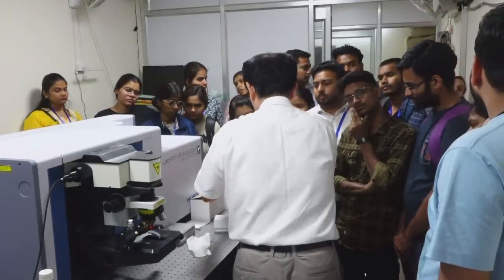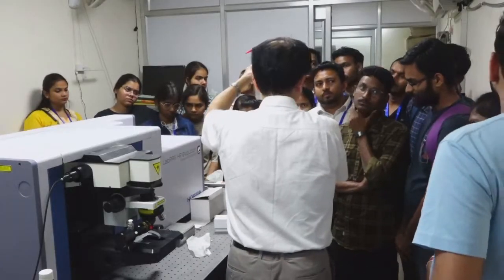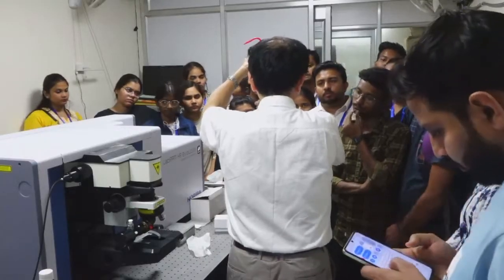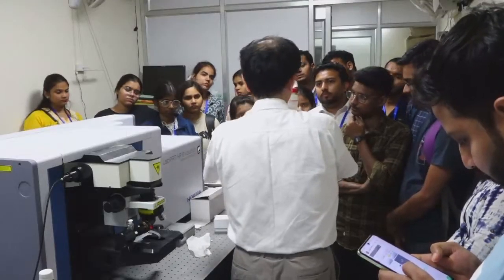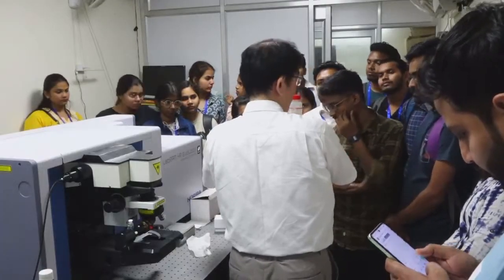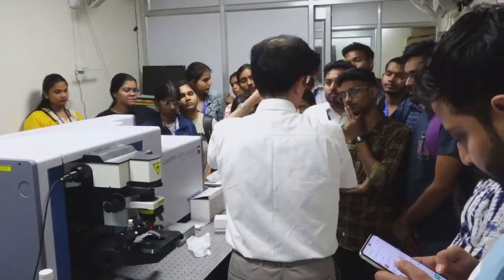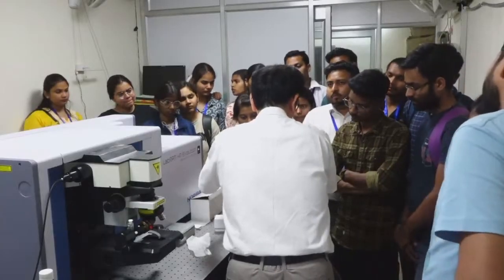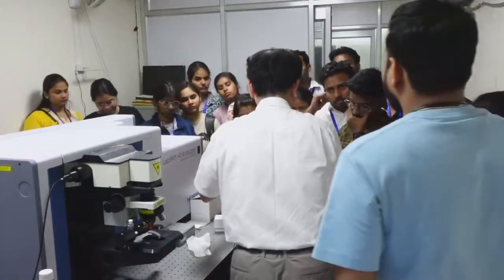In the case of 90-degree scattering, we need to focus the laser onto one point by tuning this lens, and also we need to set this optics to the appropriate position. So we need two optics. In this setup, only one element is used. So the good point for excitation is always the good point for signal collection. In that sense, this is advantageous.